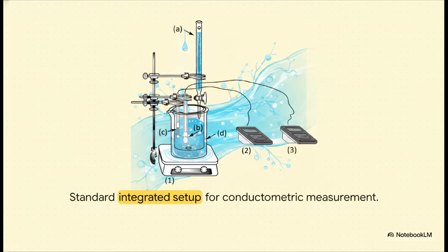And this brilliantly illustrates the setup in practice, which requires absolute precision. Notice the burette suspended right over the beaker containing our vinegar sample.